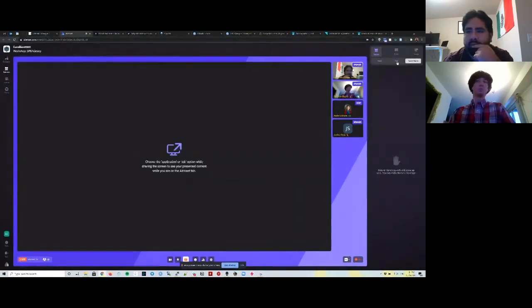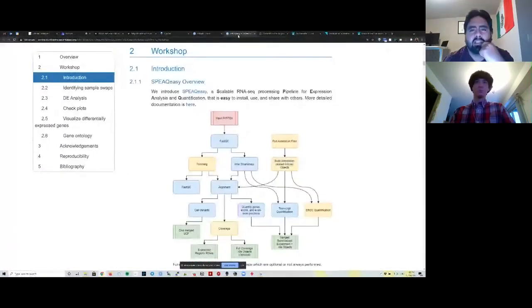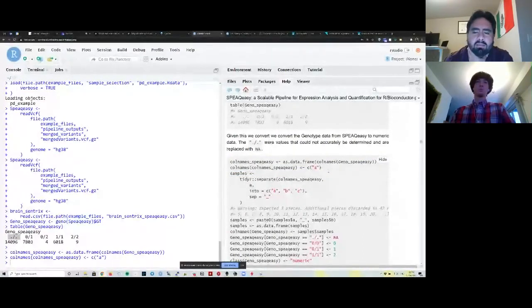I'm not sure. I had one question myself, which is, can you do variant analysis on RNA? Only a small fraction of the variants are coding variants, so that means that they overlap genes, and are thus measured by your RNA-seq data. Something you have to take into account when working with coding variants from RNA-seq is that you might not have enough reads across your variant, right?